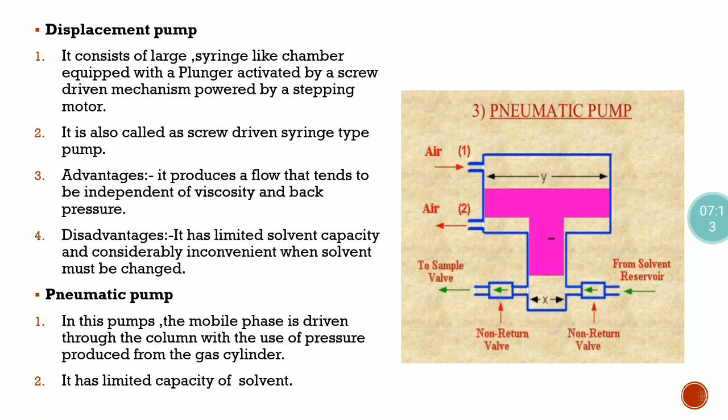Third one is pneumatic pump. In this pump, the mobile phase is driven through the column with the use of pressure produced from a gas cylinder. It has limited capacity of solvent.